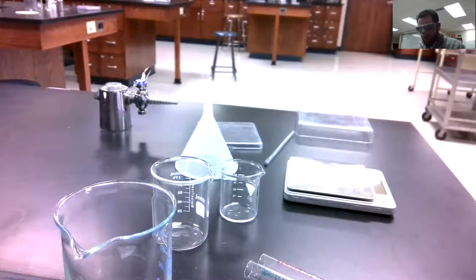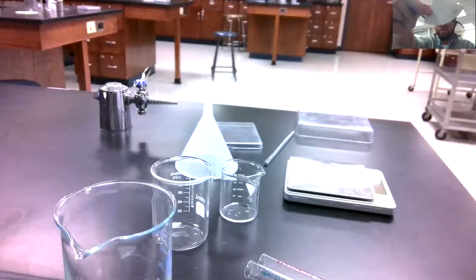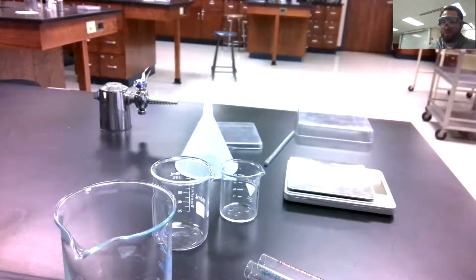And before we do anything, I'm going to go ahead and write my initials on it. When we're in class here, we're going to set these all to the side. It's going to be something I want to identify. So there they are. Got my initials on there. Can even put my period. I've got all periods. There we go. This way I'll be able to find my filter paper when we're all done.